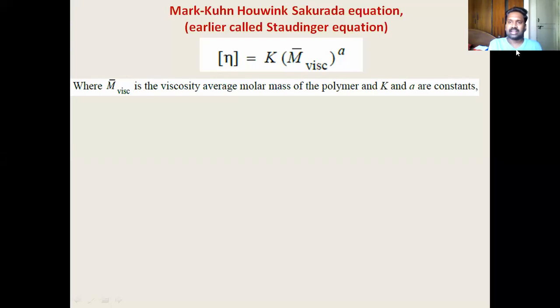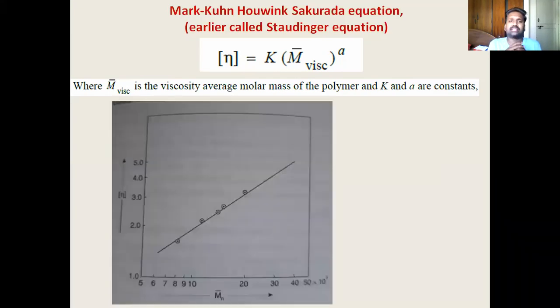Yes. So as I said, the equation is simple, but involves a lot of back calculations and calculations. Anyways, as for how to determine this viscosity, you just have to plot a graph of intrinsic viscosity against the molecular weight. Now, you can even convert this into a logarithmic plot also.